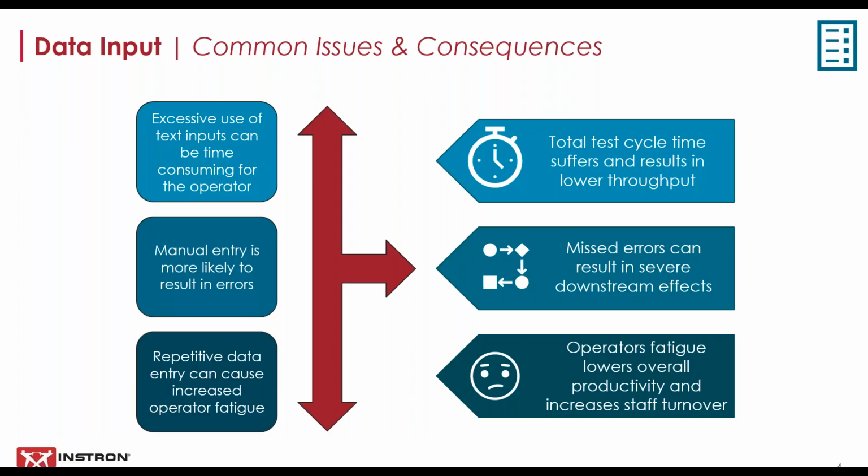So first, we're going to walk through data input, often really the most overlooked process during testing. A well-conceived testing procedure and setup can be completely overshadowed by a time-consuming and error-prone data entry process. Especially in quality control testing, there are generally several parameters about the sample and specimen which need to be recorded at the time of testing. Many companies utilize text inputs because it's what they're used to and it's what they've always done, forcing operators to manually enter data for each specimen.